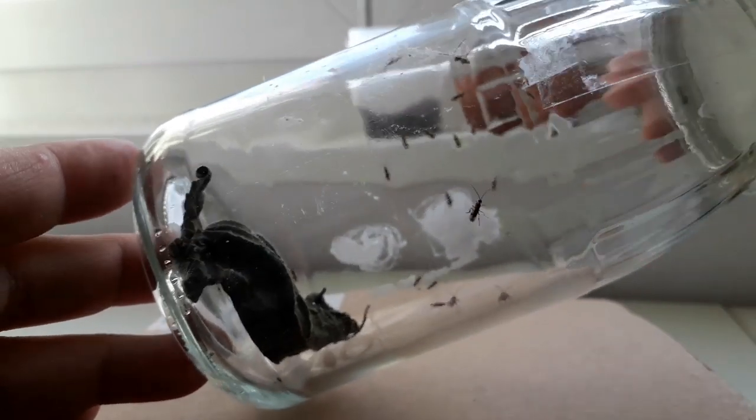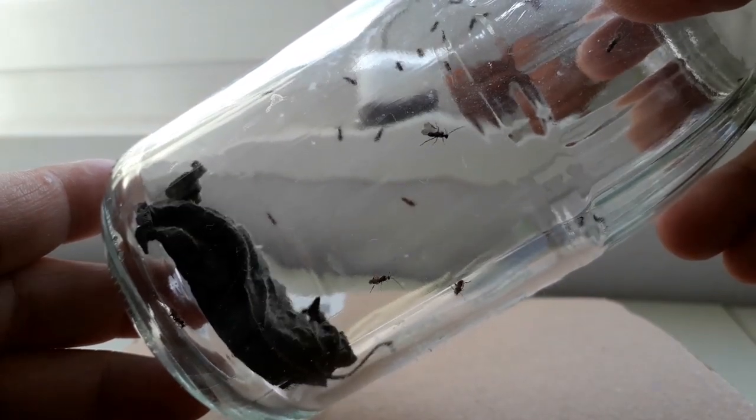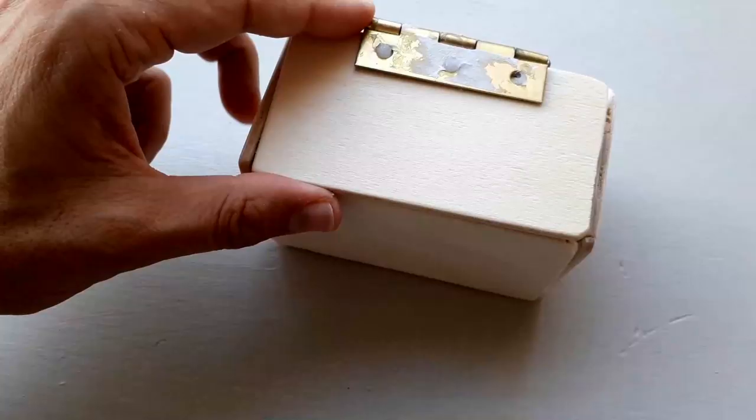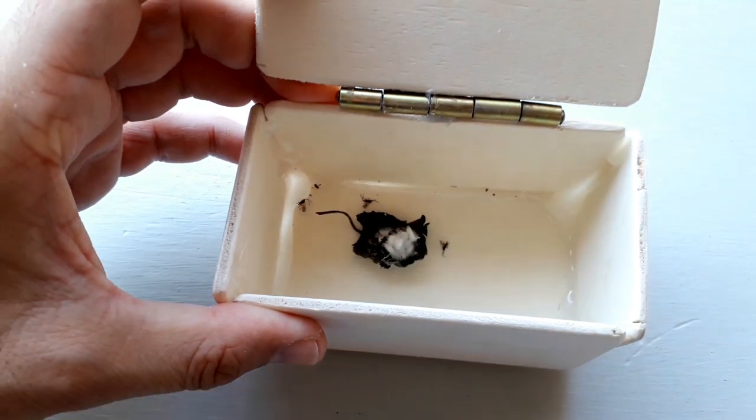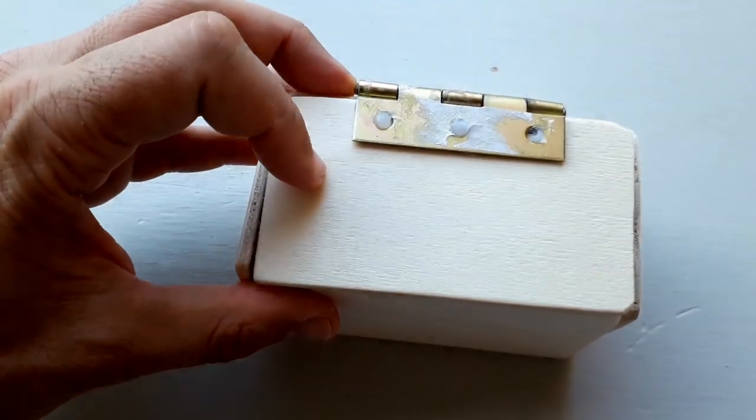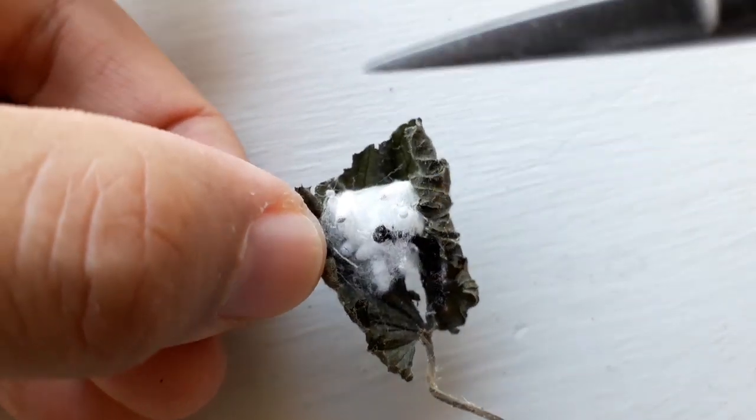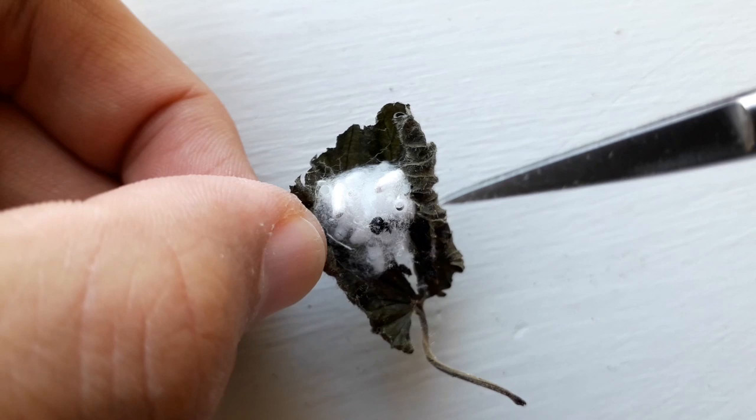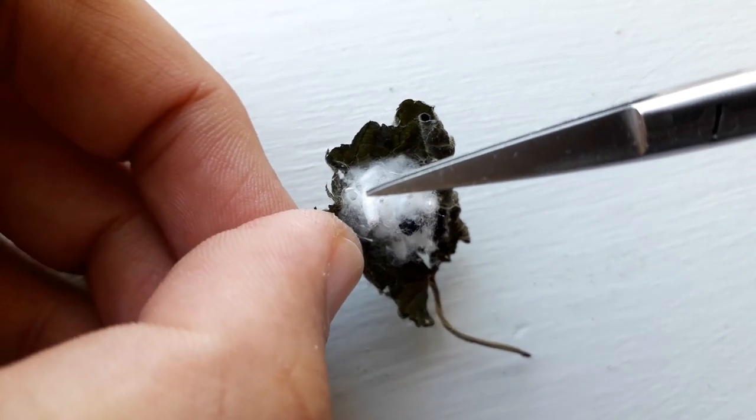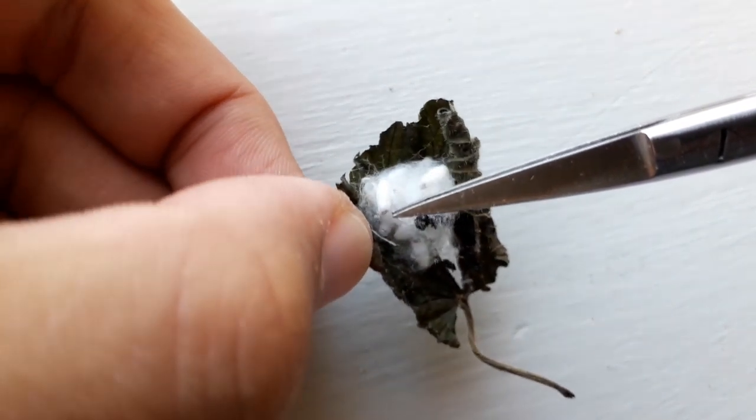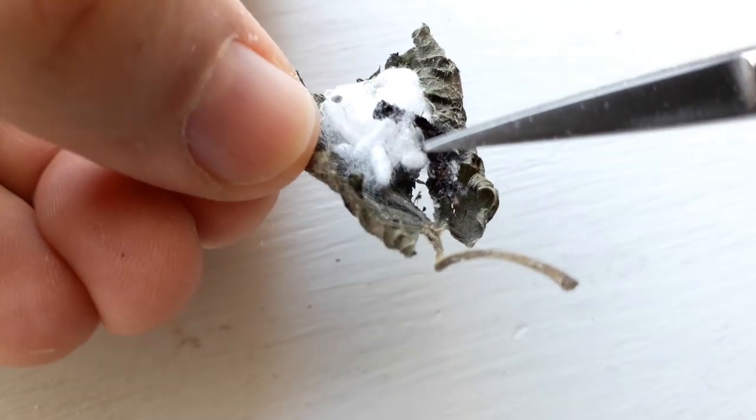Then it was easy for me to observe them under the microscope. The children, however, were very sad that the caterpillar passed away, so they even constructed a wooden coffin and wanted to bury it in the forest. Let's have a closer look at what was left over. The caterpillar is still there, and the cocoons now have a little round opening on one side where the wasps emerged after metamorphosis. Pretty much all the cocoons had this small opening.